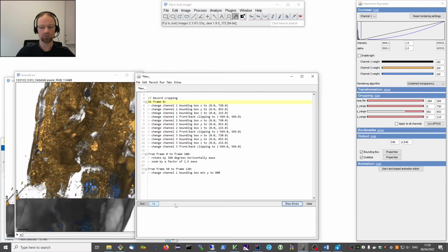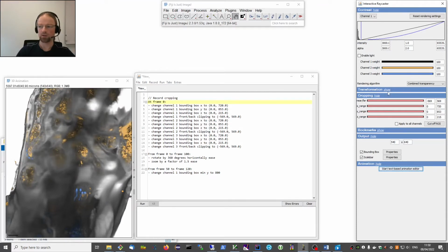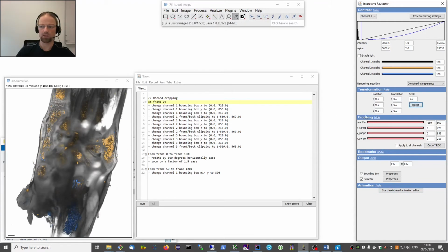Okay, so let's try the kill. Kill also works, and let's close this. Now there's some issue related to this initial state problem, and so right now we always started. So let me reset this so that it looks a little nicer. Now all our animations started from basically the identity transformation, so with the untransformed object.